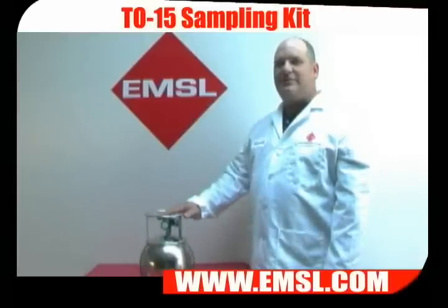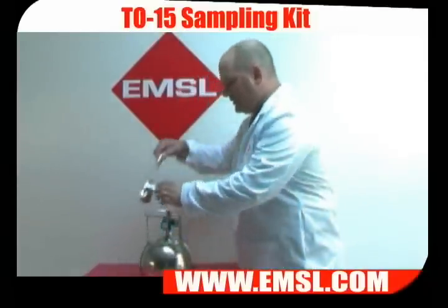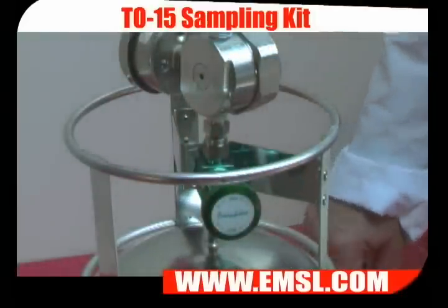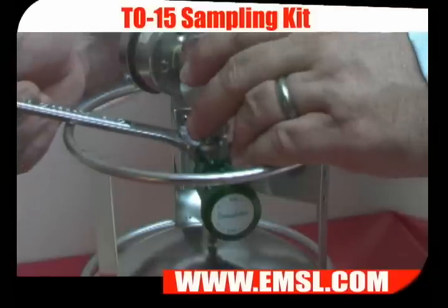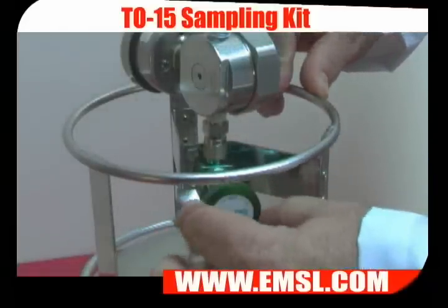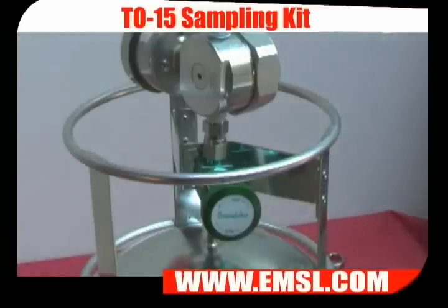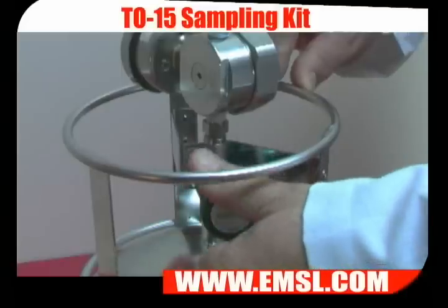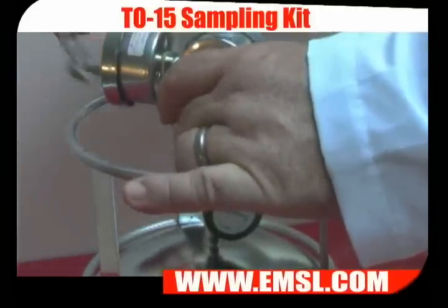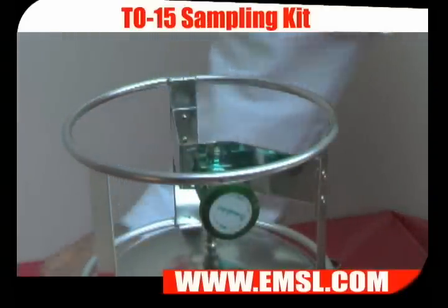Here's how to sample for a specified time using a six-liter canister. Remove the dust cap and install the flow controller. Tighten it with a nine-sixteenths wrench. Open the valve one turn. At the end of the specified sampling period, close the valve. Loosen the flow controller, remove it, and replace the dust cap.